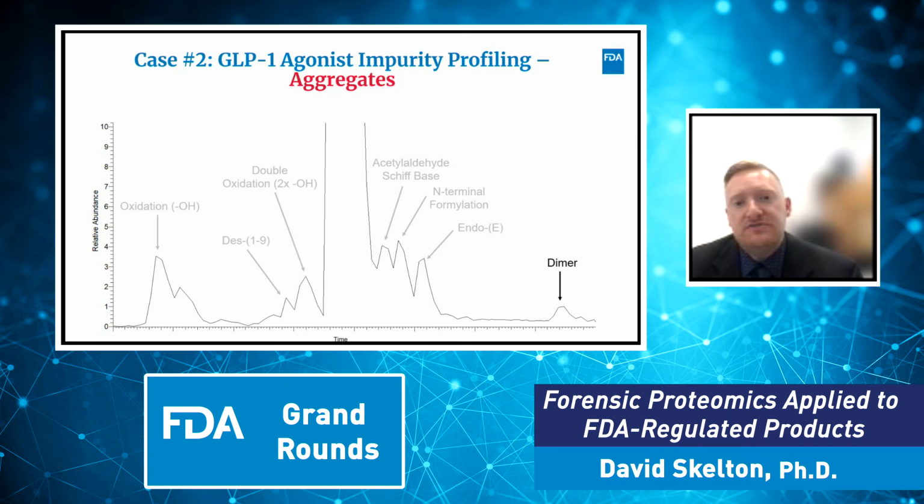So this information can be provided to the special agents or the investigators who are submitting these samples. We can provide this impurity profile to them as a means to determine the source of potential counterfeits. Some of these impurities can also potentially elicit immunogenic responses in the patients, so they can have adverse health effects. And it also aids us in determining whether the products that are sent to us are authentic or counterfeit.